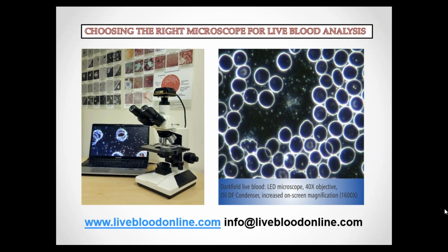Well, that's an interesting question. A lot of hematologists would still argue that you can't really distinguish the different types of white blood cells, for example, using an unstained sample, which is of course completely incorrect if we look at our course materials and how to identify the white blood cells correctly. But it's perhaps just what is taught at university level.